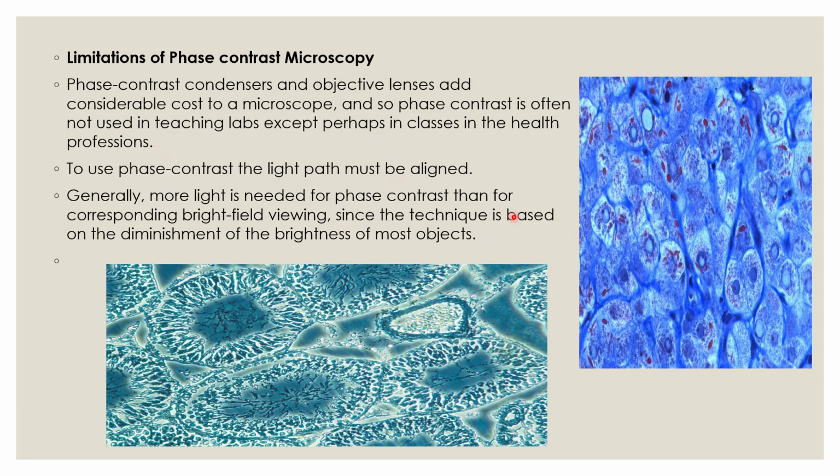But it also has certain limitations. The objective lenses and the condensers which we use, and the cost of this, is high. Because of the cost, we don't usually use it in any other area. It is used by health professions, but we don't often use it in the teaching labs because of the cost.